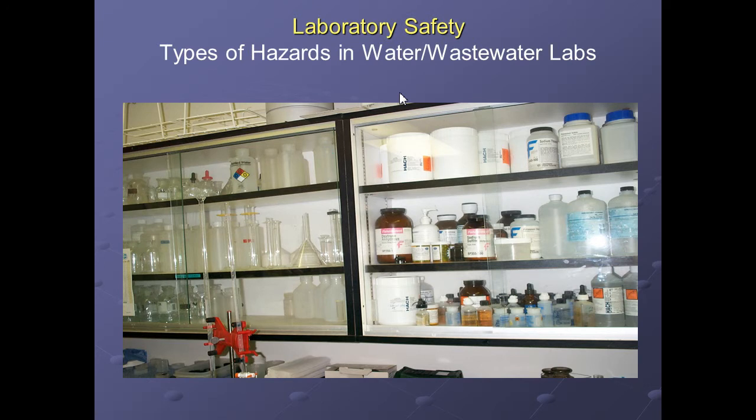All right, that's quick with the documentation portion, and we're going to go into the laboratory safety. This is going to be a little different than what some of you are used to, because in the laboratory and chemical handling portion, we're going to go over the new globally harmonized system for classification and labeling of chemicals, and that, very short, is GHS, the new globally harmonized system.